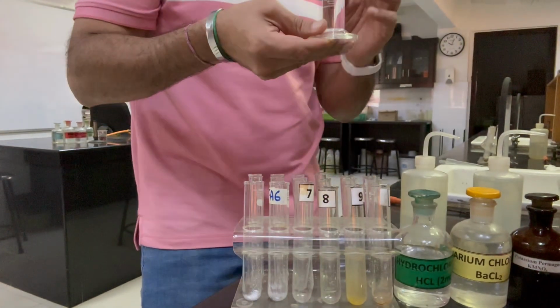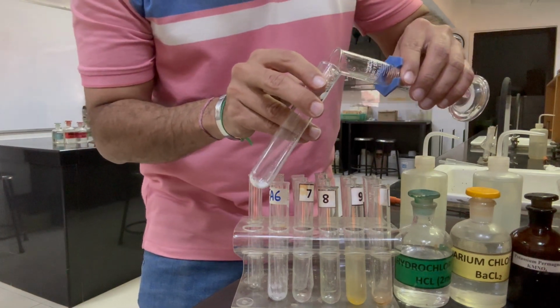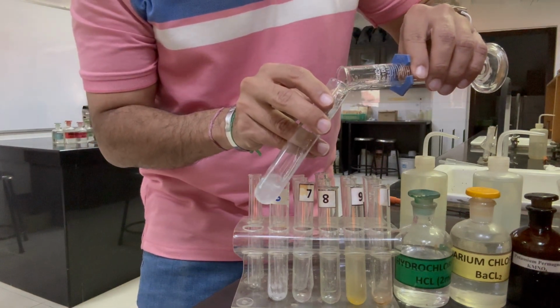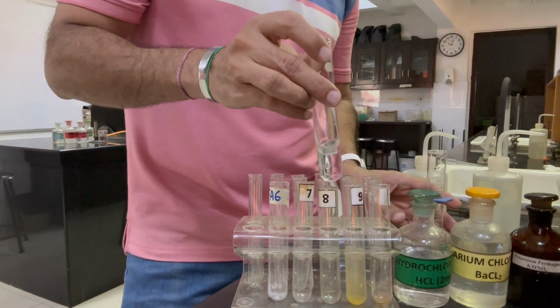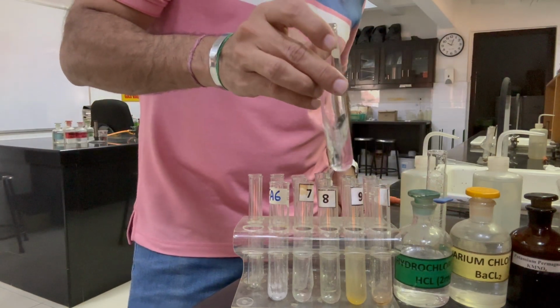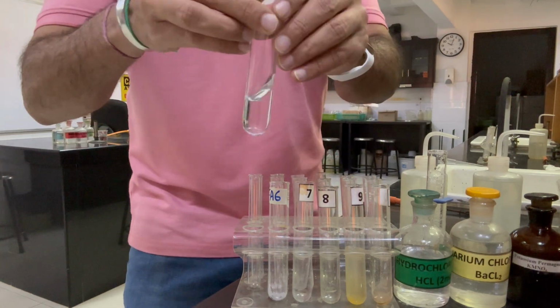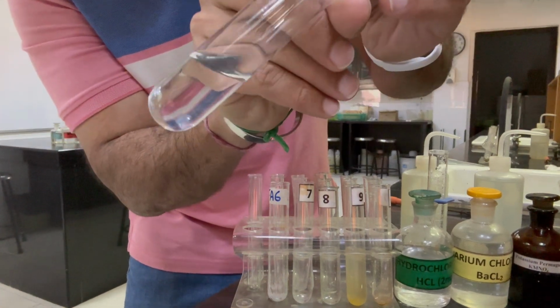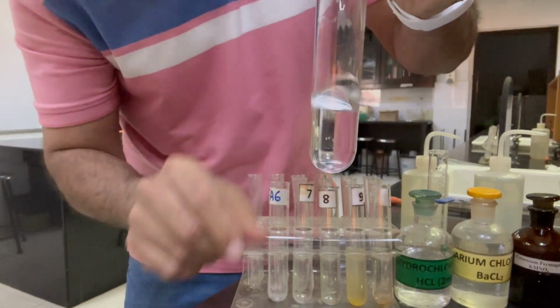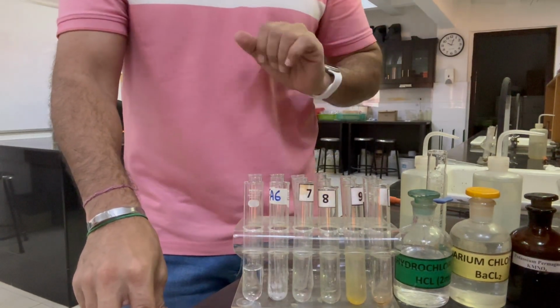Now I will add this in a tilted tube so that it will dissolve completely. Now we can see the solid is completely dissolved. So this is my Fa6 solution prepared.